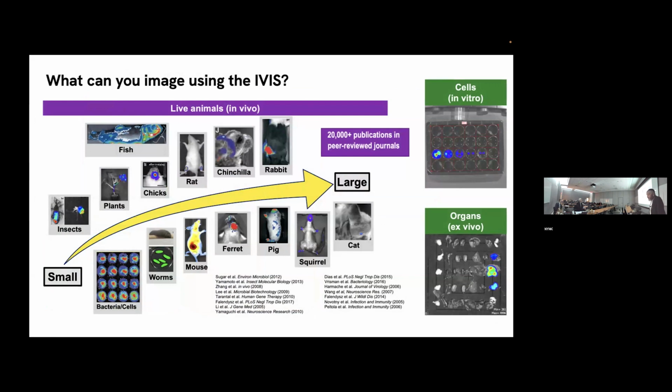What kind of animal can use this? Insects, plant, rat, rabbit, basically any type of animal. And the tray that I showed you earlier can be enlarged or made smaller depending on the animal. Obviously, you cannot put a monkey, even the macaca mulatta monkey that they have at Lovelace will not be able to enter. But if you take only the head, you would be able to do either an organ ex vivo type of approach or some of the cells.